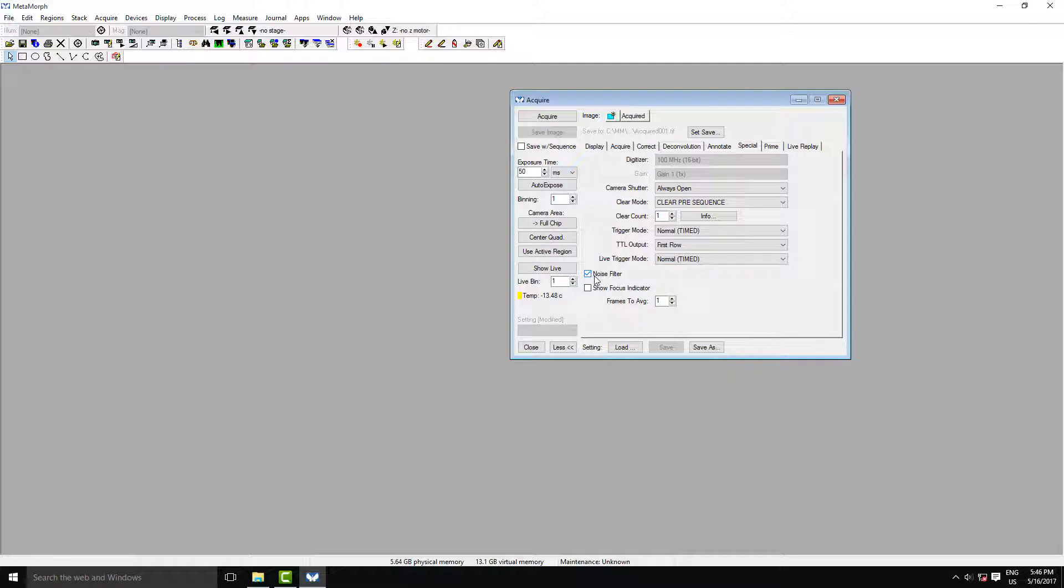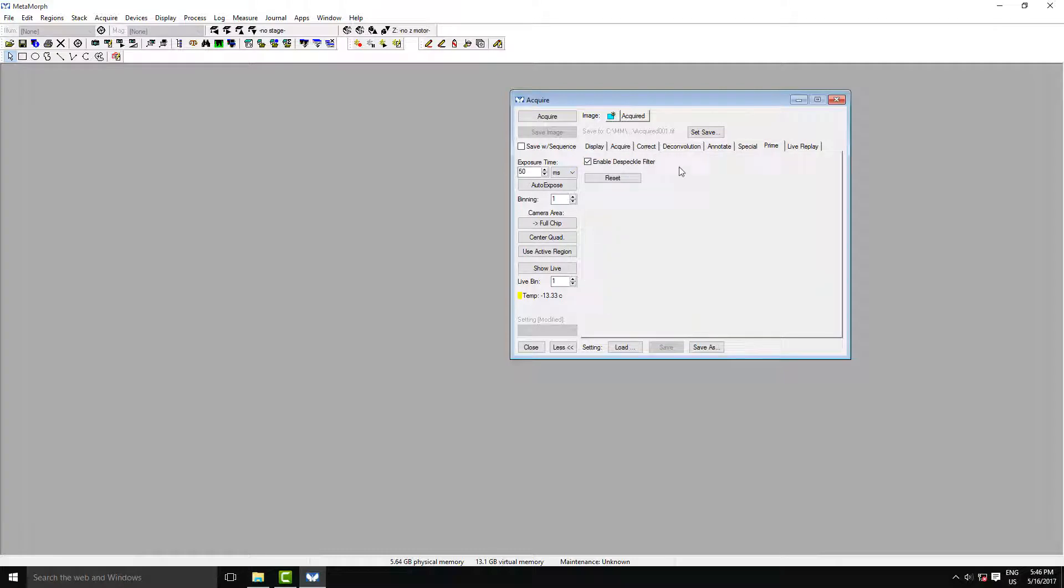When you first load up the camera, go to the Special tab and deactivate Noise Filter. The final setting is you just need to make sure that in the Prime tab, Enable Despeckle Filter is checked. This helps deal with any particularly high or low pixels that might skew your histogram.